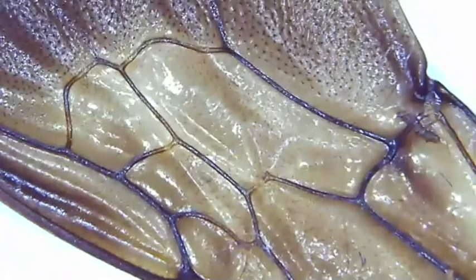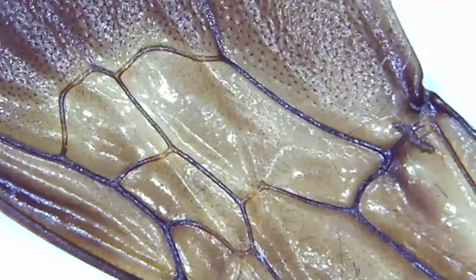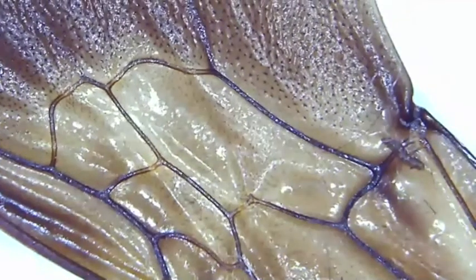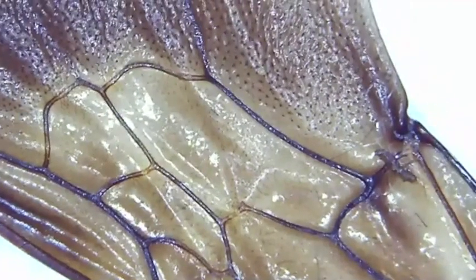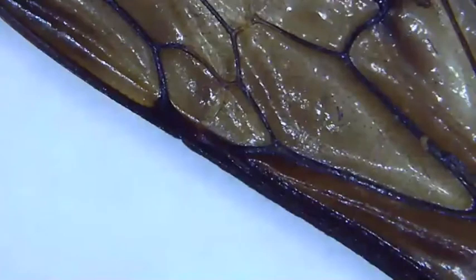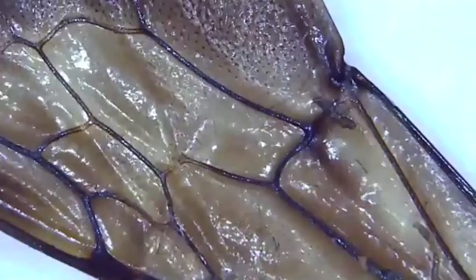Jerome, what do you think? A fish. A what? Fish. Yeah, I can see that too. What about you, Ani? A butterfly wing. Ooh. Oh, Trey and Corinne said that too. That's what they had in the chat. They thought it looked like a butterfly. Wow, yeah. So you guys have all sorts of ideas. That's great. Yeah, it looks like it could be all of those things under the scope.